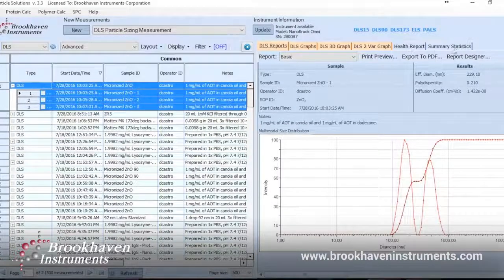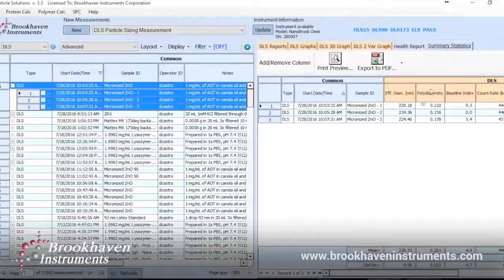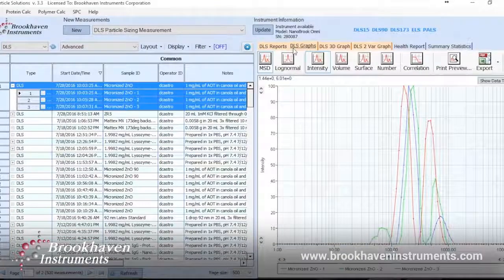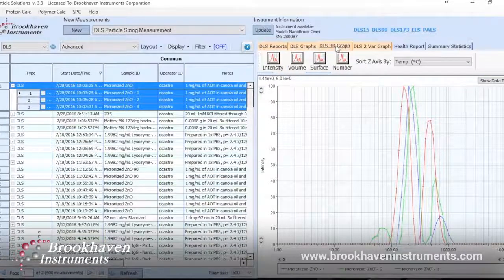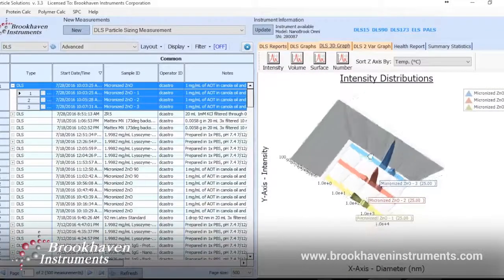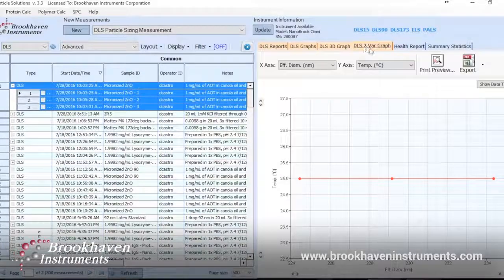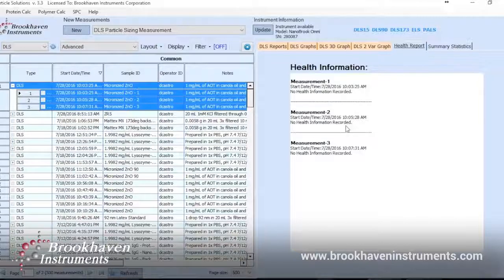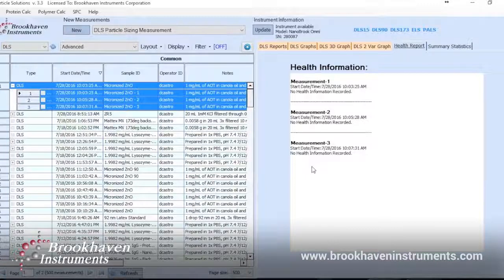Clicking summary statistics gives mean, standard error, and standard deviation of the effective diameter for three runs. In DLS graphs, we can see the multimodal distribution for each run collectively or individually. This same graph can be viewed in 3D to better visualize the overlay. A two-variable graph can graph any two variables you'd like to see a relationship between. Finally, the health report gives any possible insight on how to improve the measurement, such as cleaning the sample or increasing measurement time. Our measurement was healthy as no suggestions were given.